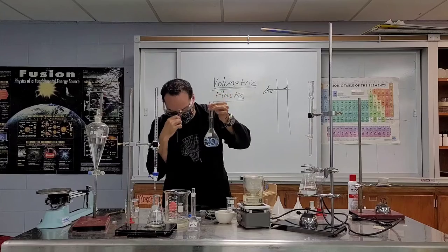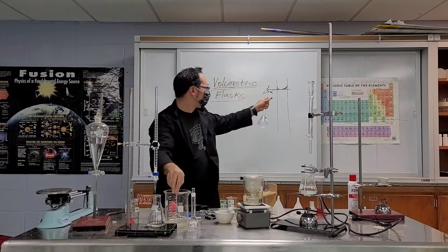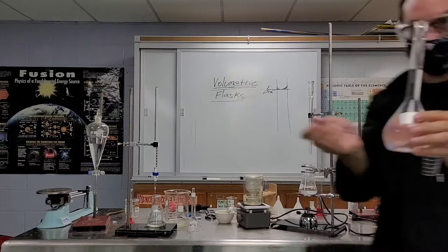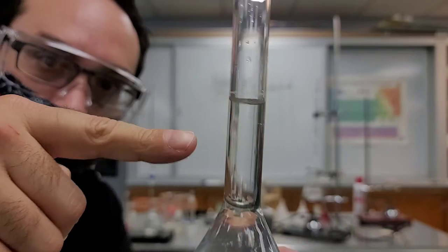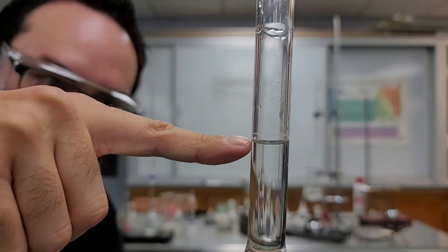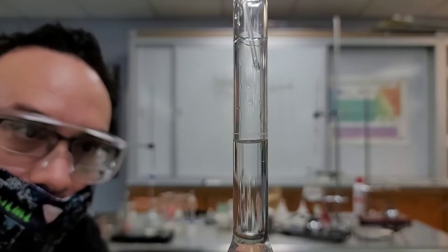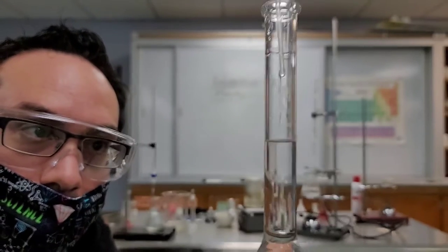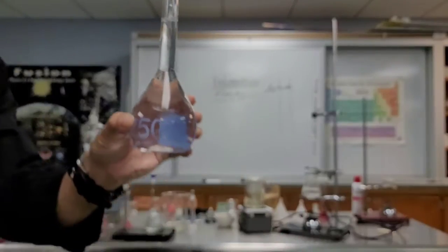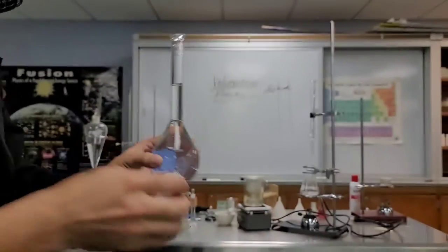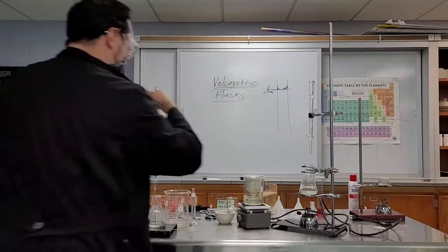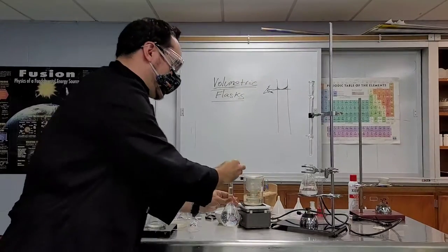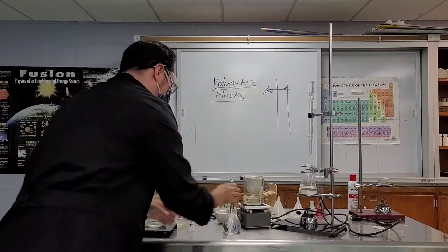I'll show you. I don't know if you can see it, the water makes this curve so I want to look at the bottom of the curve, boom, done. Okay, so that should be basically almost exactly 250 milliliters.